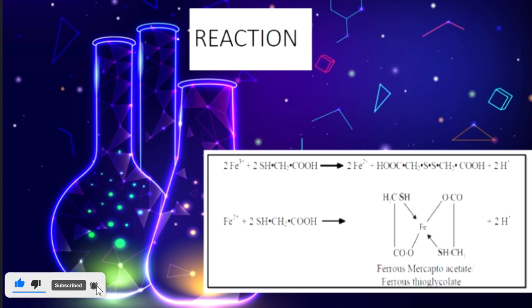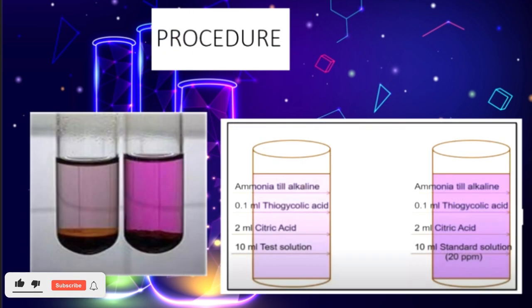The next is the procedure. This procedure is not comparable with sulphate or chloride; it has a separate procedure. As in every limit test you will have two Nessler cylinders, except in the arsenic and heavy metals tests.